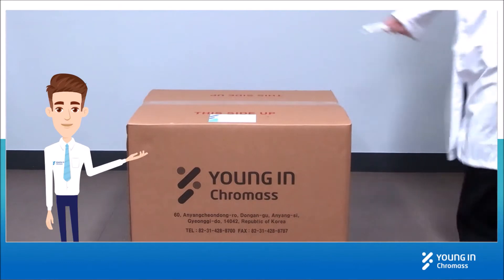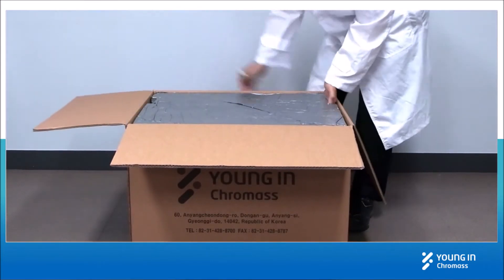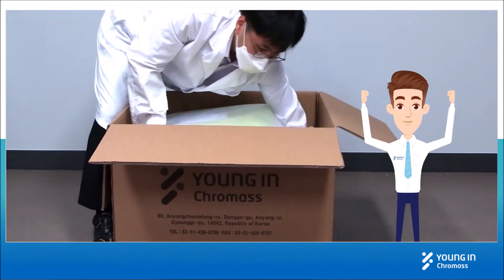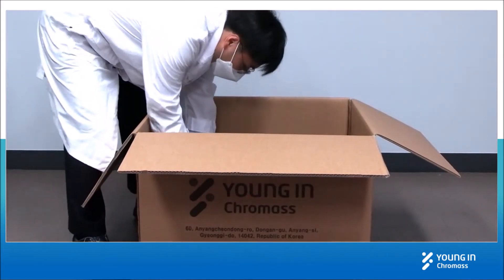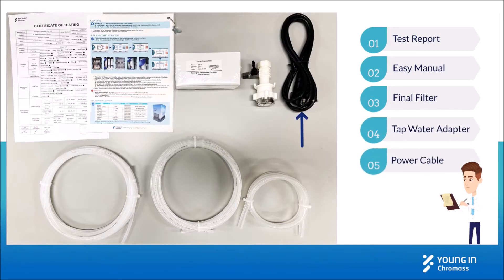We start from unboxing. Open the box with a cutter or scissors and take out the packing buffer. Lift up the Aquipori system and take out the packing materials. There are a test report, easy manual, final filter, tap water adapter, power cable, and tubings included.